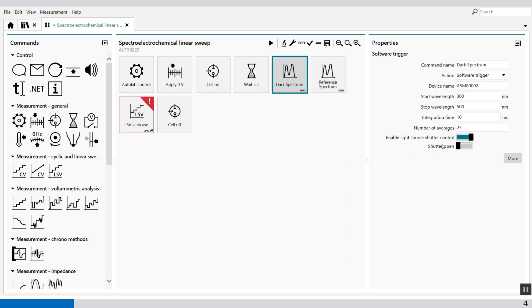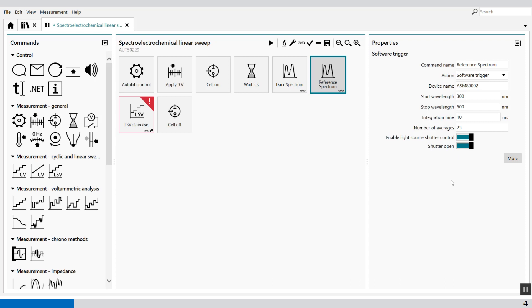The dark spectrum the shutter was closed so no light shining through the sample. And with the reference spectrum the shutter is opened and then this light shining through the cuvette.